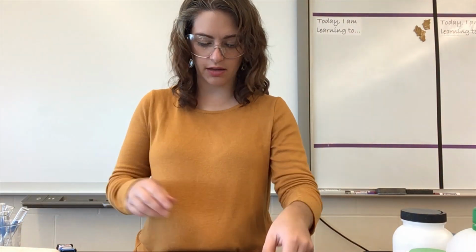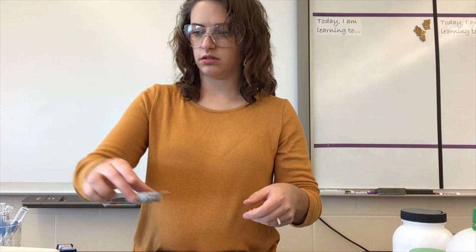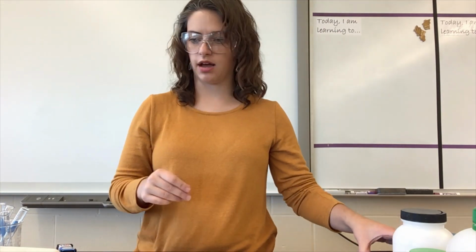Okay, and finally, melting point. So pop that on my hot plate.